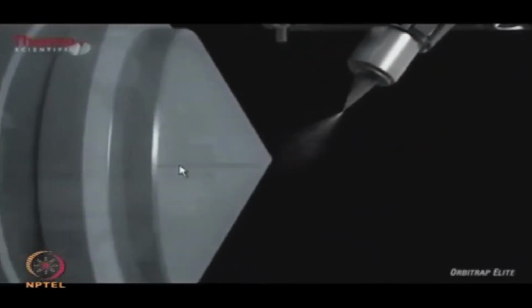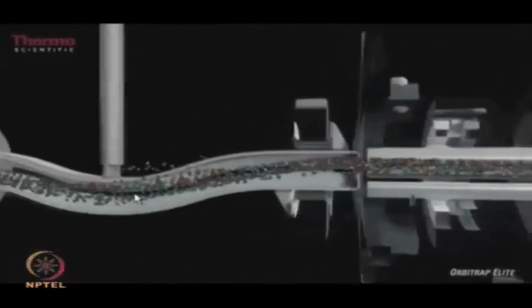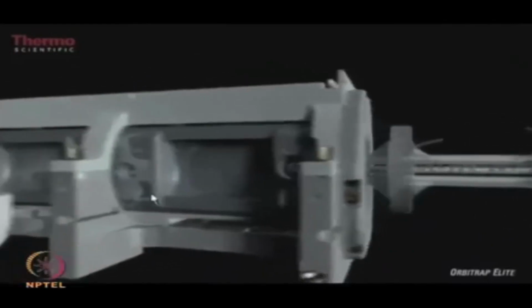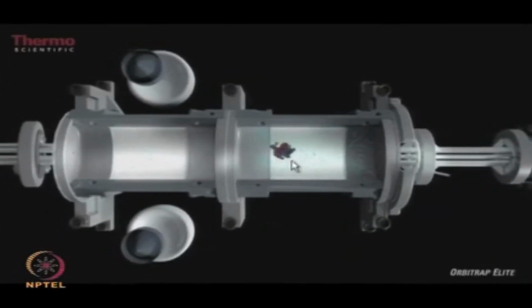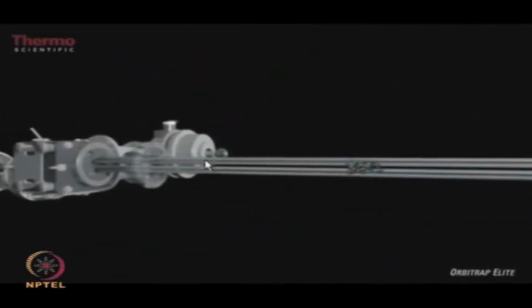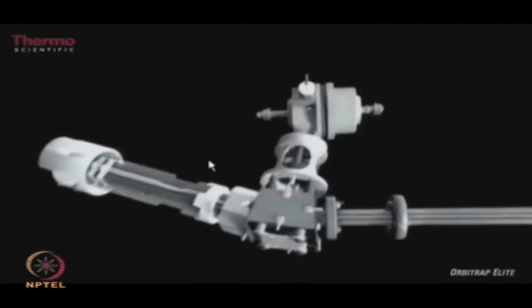Coming back to the ionization source, the ions are generated from the source and go into the transfer optics, and after the transfer optics they go to the linear trap. In the linear trap, in a full scan mode, the ions are stored in the high pressure cell. Once these ions are stored in the high pressure cell in the full scan mode, they are then transferred through the transfer optics into the C-trap.